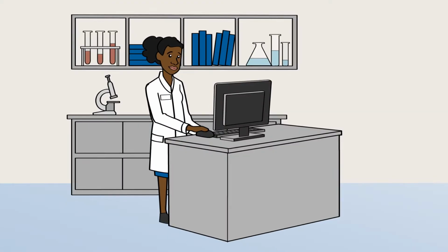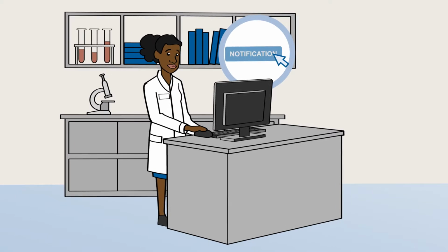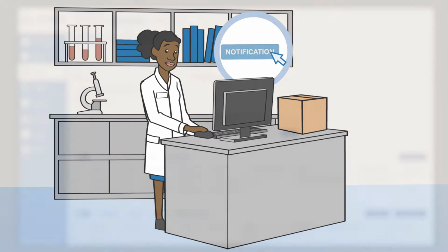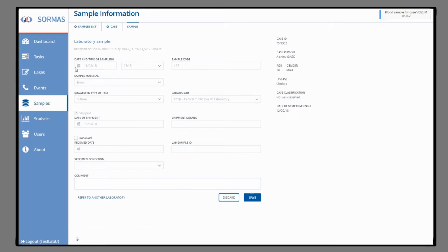Samples can reach you in 3 different ways. First, the sample has been announced via SORMAS, so there is already information on the sample and on the respective patient in the SORMAS database. In that case, you only need to select the respective sample of that case by choosing the identical sample code and add the information for that sample, such as date of sample received at lab, condition of sample, or status of diagnostic.